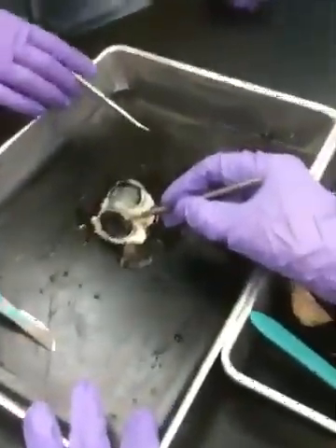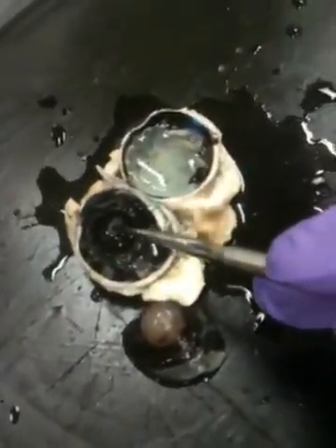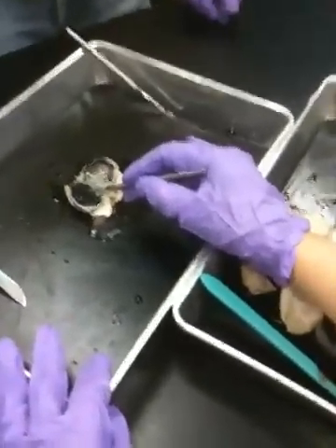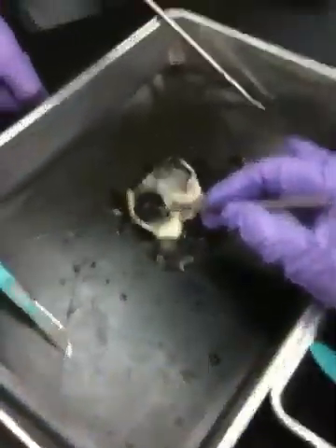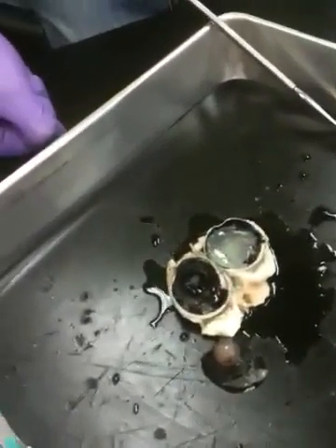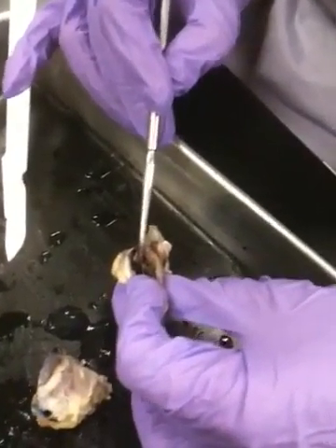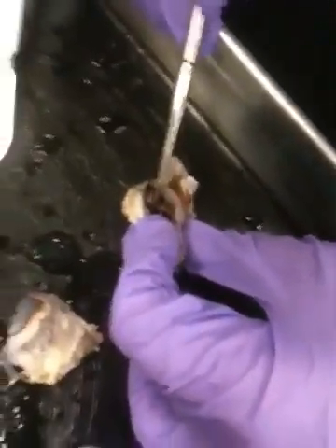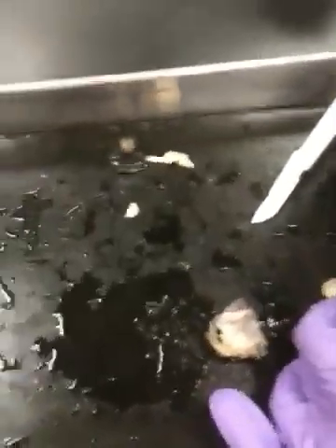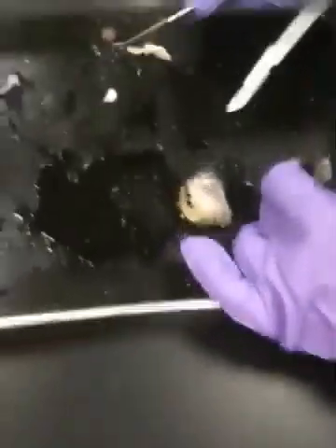And then you can see the pupil here. You can see it really clearly because you can see through to the cornea in front, and you can remember that they have a little horizontal slit, as opposed to us who have a circle. And then if we pull this back, we can see the little brown, that they have brown eyes. So this is the iris portion in here. Sort of yellowy brown eyes. That's the iris. So you can scratch out aqueous humor. Obviously we can see vitreous humor real nicely.